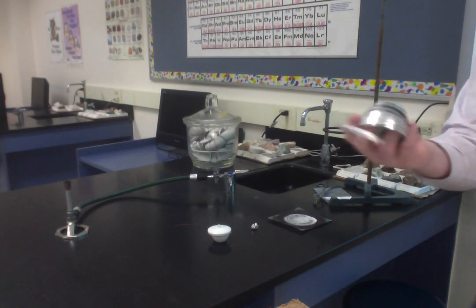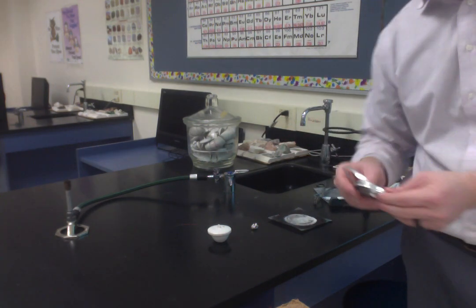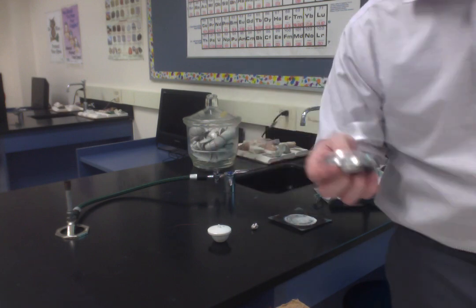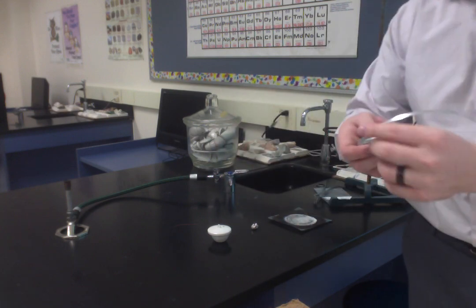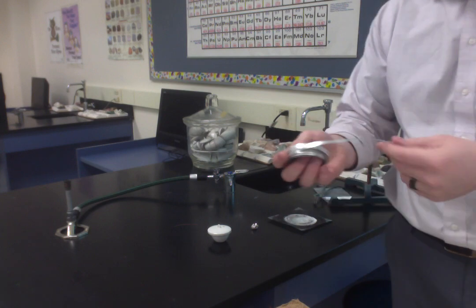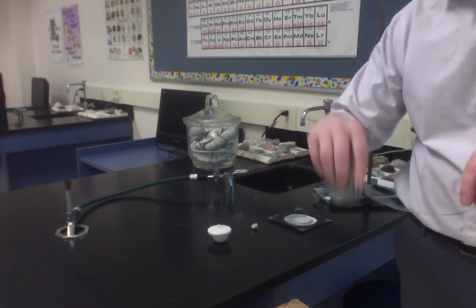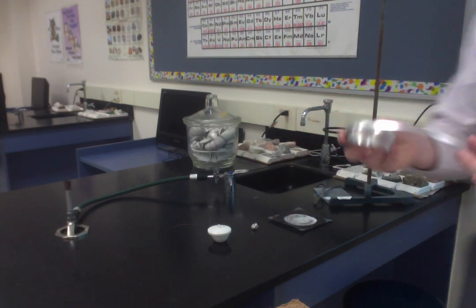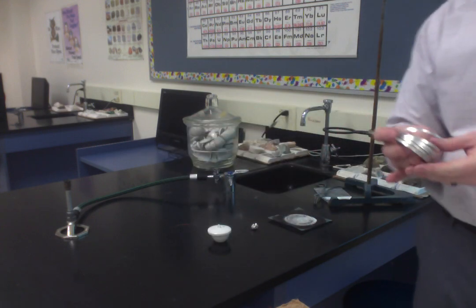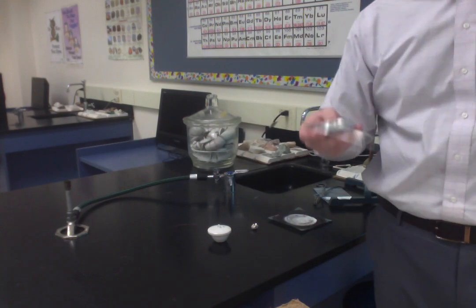And you could probably guess why it's a little dull, because magnesium, being an alkaline earth metal, is slightly reactive. It's the least reactive of them besides beryllium, and it's going to react very slowly with oxygen in the air over time. So we're going to remove that outer coating of magnesium oxide, produce fresh magnesium underneath so it can react very quickly with the Bunsen burner. Now I said it reacts slowly with oxygen. That's at room temperature. If you put it in a Bunsen burner flame, well, now we're talking about an incredibly fast, nearly instant reaction.